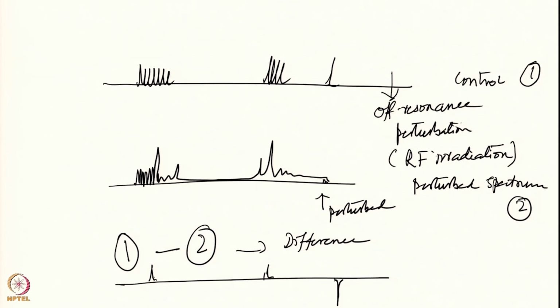So you have some change happening in this particular line, and some change happening in this particular line, because these are the ones which are dipolarly coupled to the perturbed line. So these are the enhancements, or there can be decreases also, and depending upon that we will have some perturbations in these areas, okay. So these are the relayed perturbations. And this effect is known as NOE, okay.